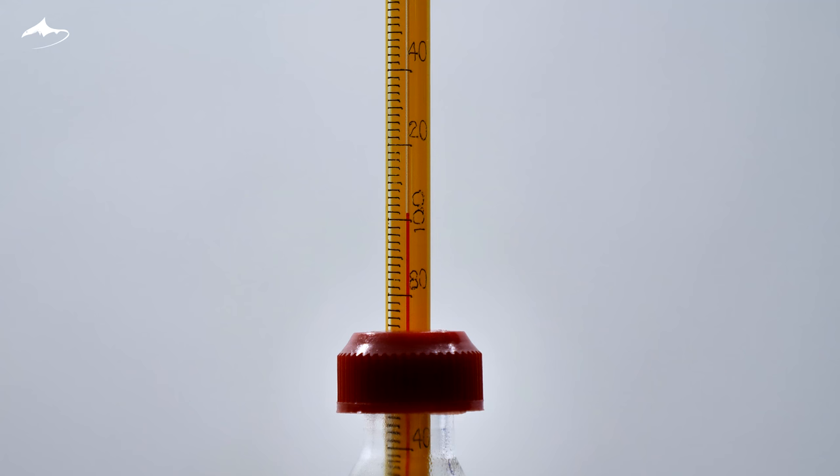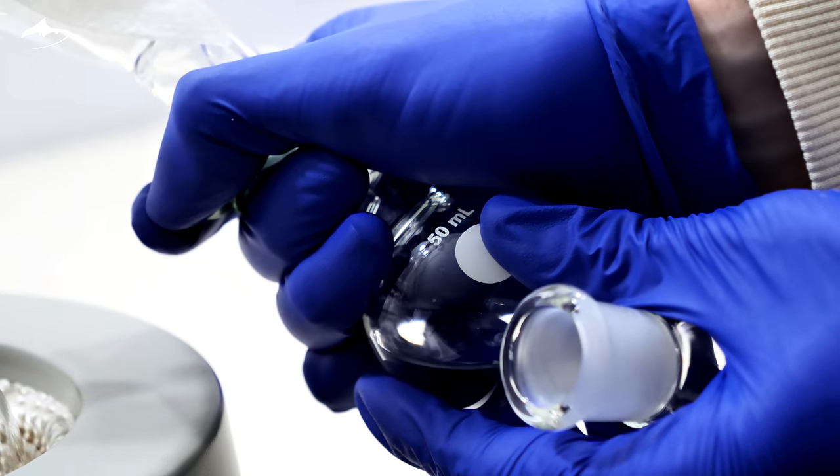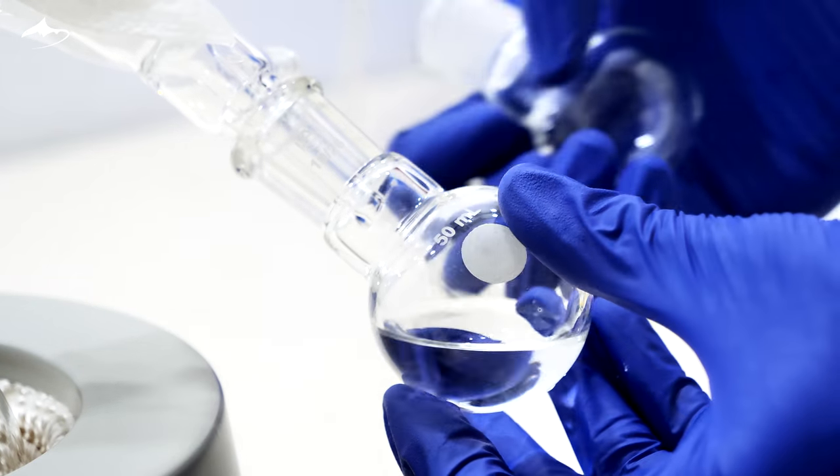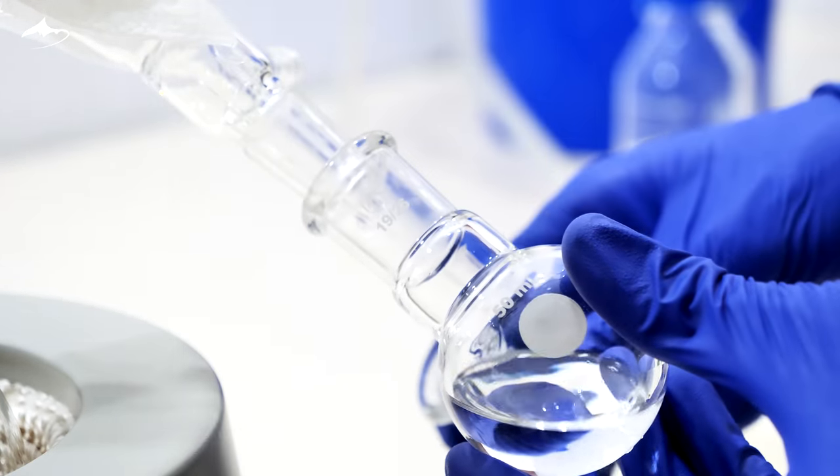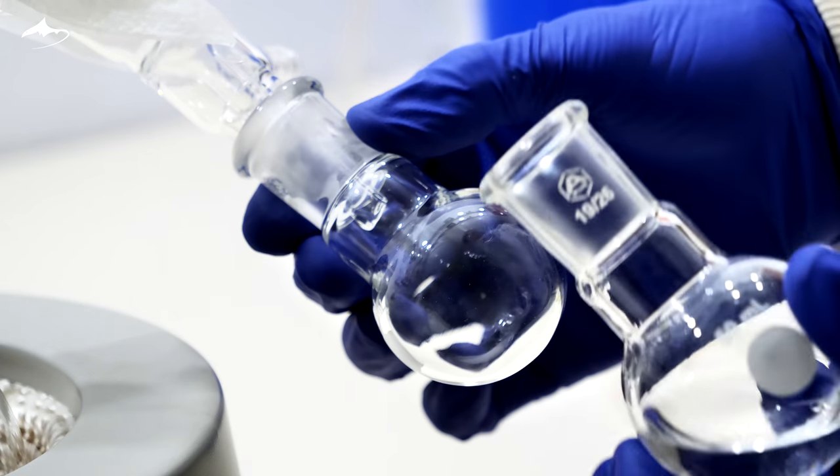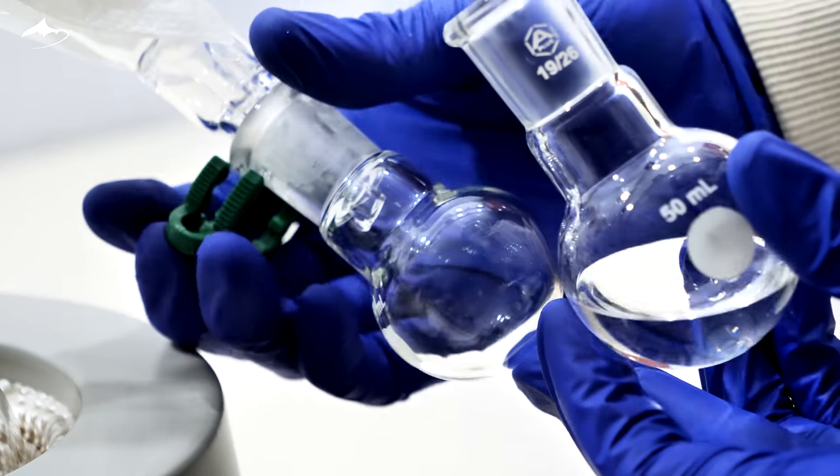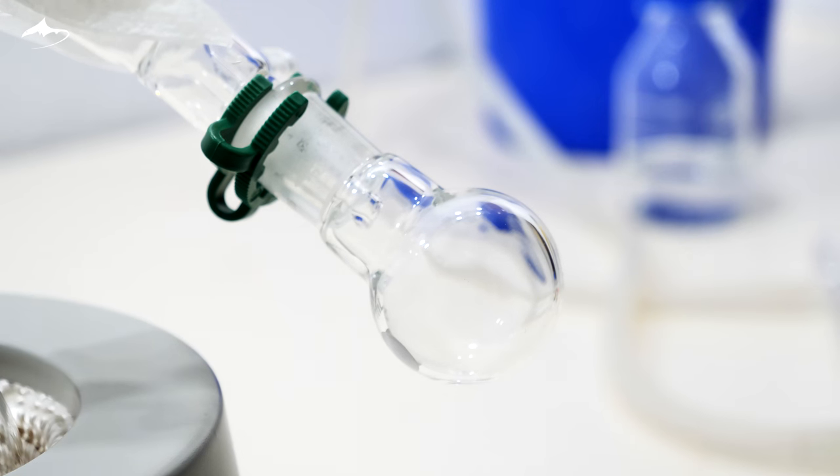After some time, the temperature surpasses 100 degrees Celsius, so the collecting flask is changed to collect a new fraction of distillate. It is collected until a few milliliters of liquid remain in the boiling flask. The temperature reaches 145 degrees Celsius, which is still below the boiling point of butyric acid.